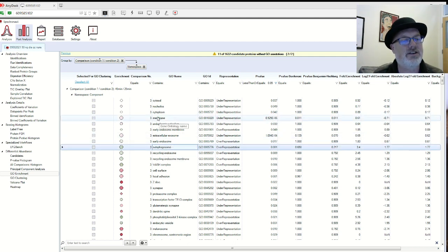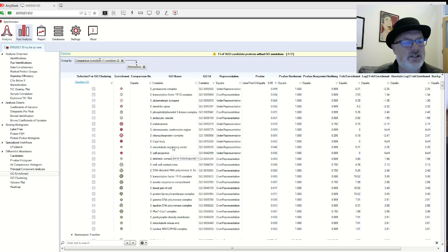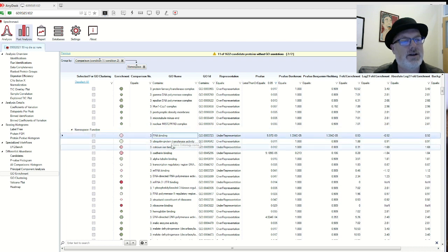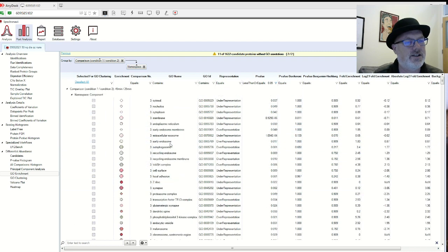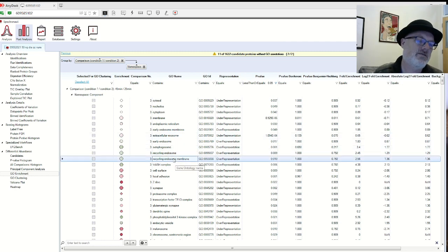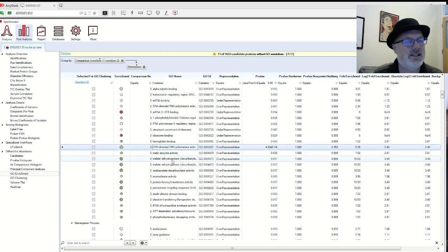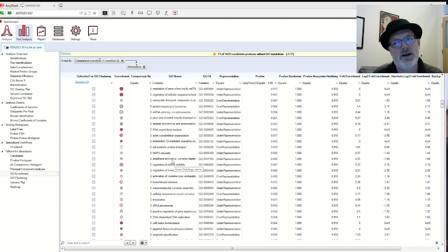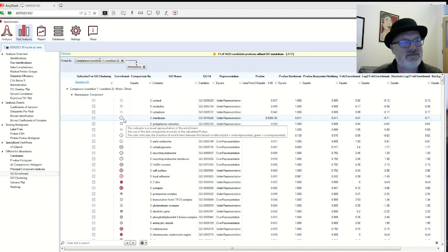So you can tell, for example, if your membrane proteins are different across your different experiments, or you can look at something like RNA binding. So this is actually really useful, if you have different profiling conditions, and this tells you that your RNA binding proteins are differentially regulated between your different conditions. But for this experiment, it makes absolutely no sense whatsoever, and I have to think about why it's showing me this. Obviously, it makes no biological sense because it's the exact same sample, just run on different gradients. But if you're actually doing something reasonable, like a different biological experiment, this would be useful.